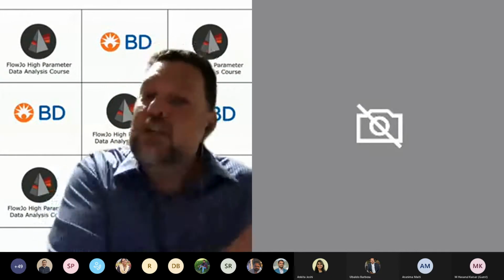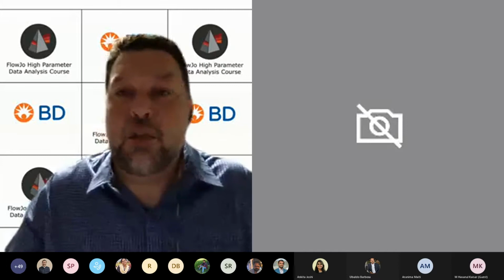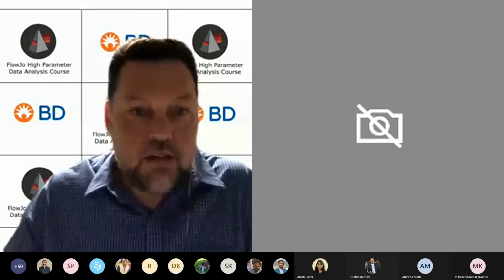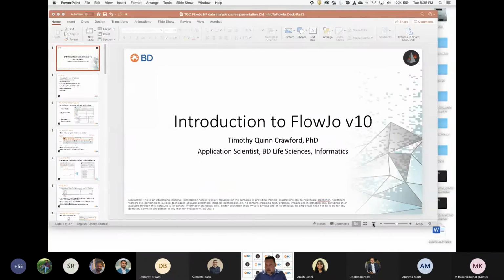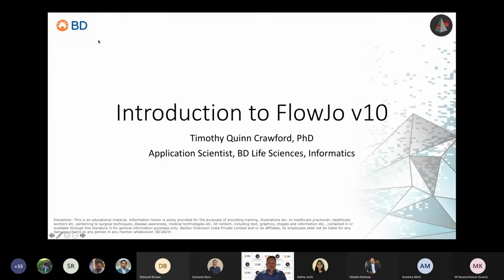So I'll go introduce a concept in a presentation format, and then I'll go show it to you within the application. So I'm going to share my screen here, and we will get started. Just go into presentation mode here. I believe you should all be able to see my screen at this point. I'm going to go into a slideshow.